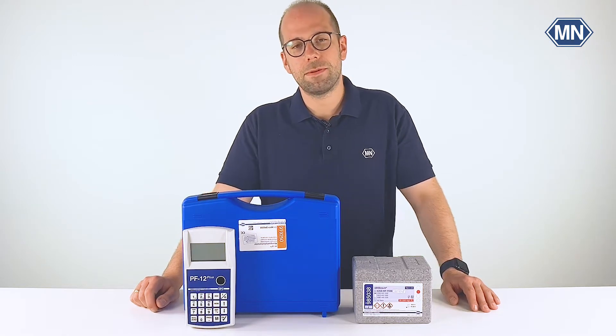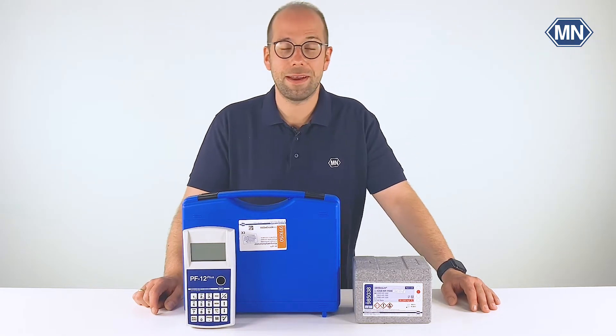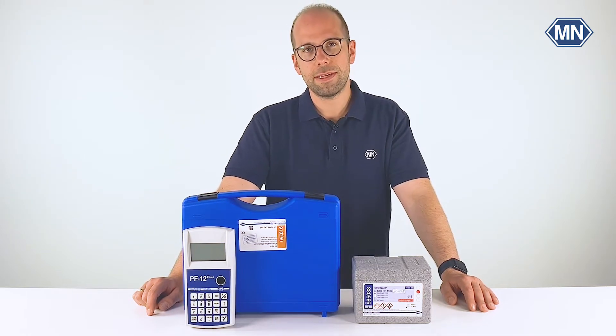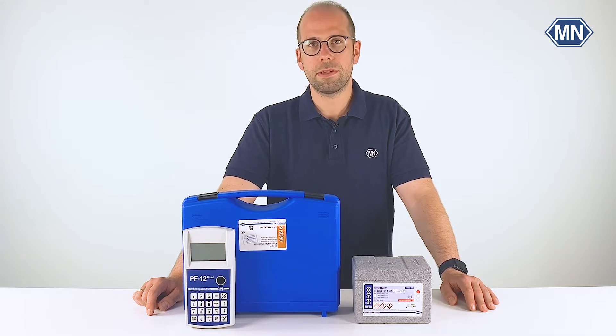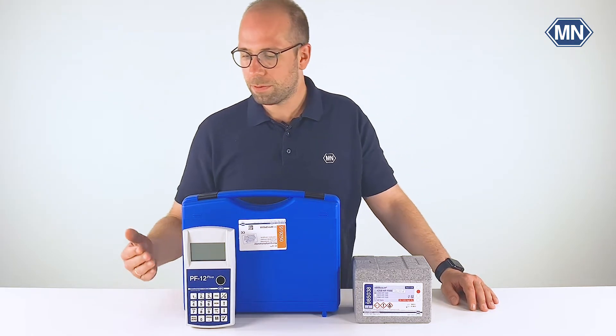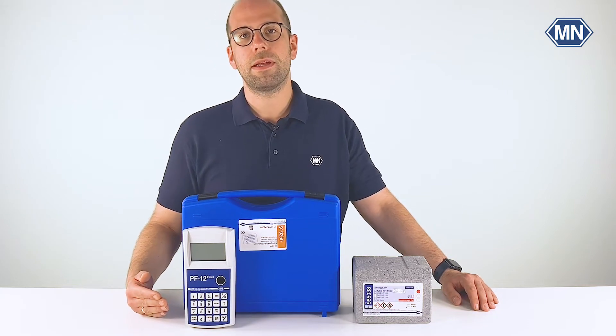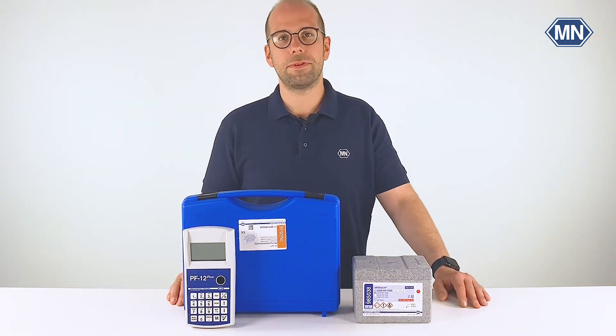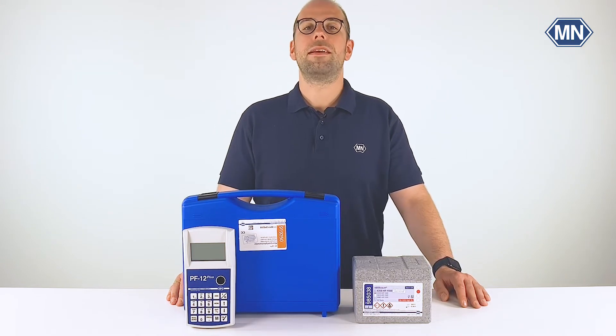Hello everyone, my name is Florian. Welcome to the YouTube channel of Macherey-Nagel. In our last video we showed you the unboxing and all the accessories which you will get when you order the PF12 Plus compact photometer. In today's video we will focus more on the photometer itself. I will show you everything which is needed from getting started to the first measurement result. So let's head right into it.